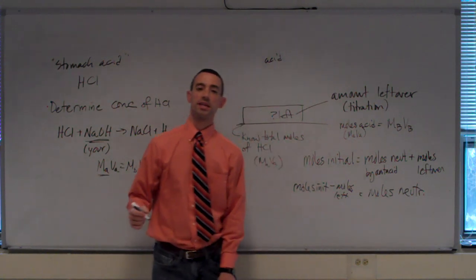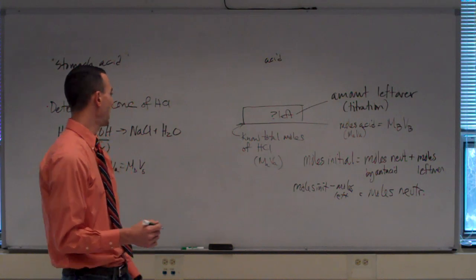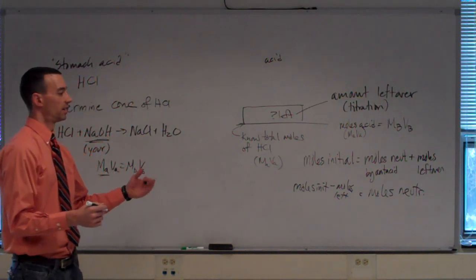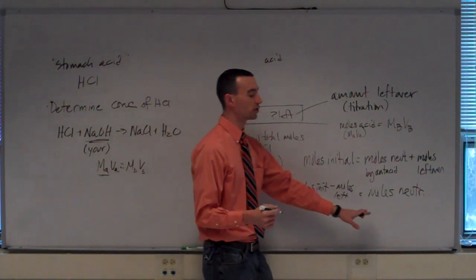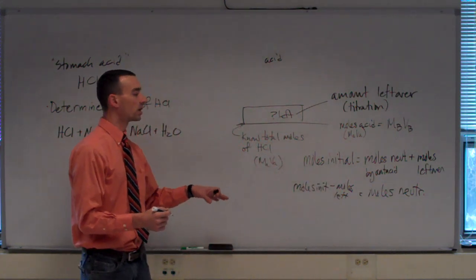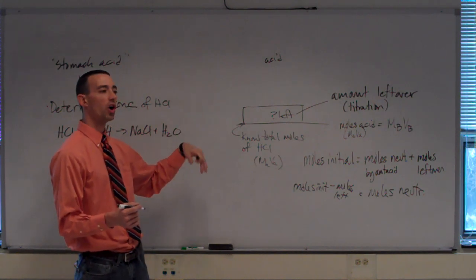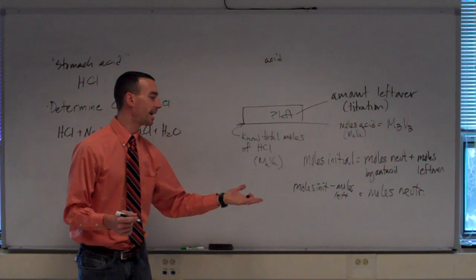Once you know how many moles are neutralized, you've determined essentially one of the numbers we were looking at in the pre-lab questions: how many moles are eliminated per tablet.